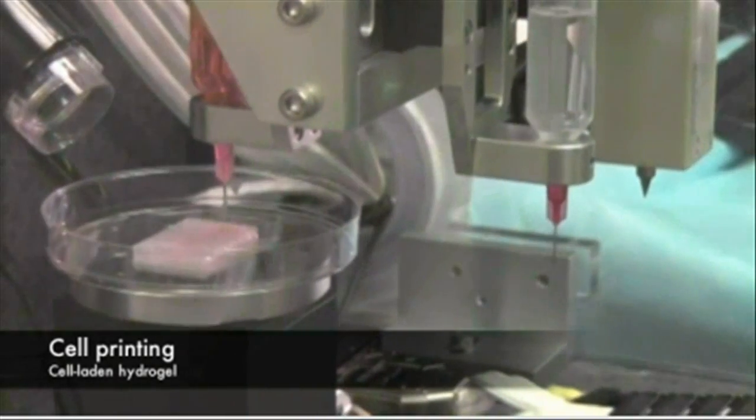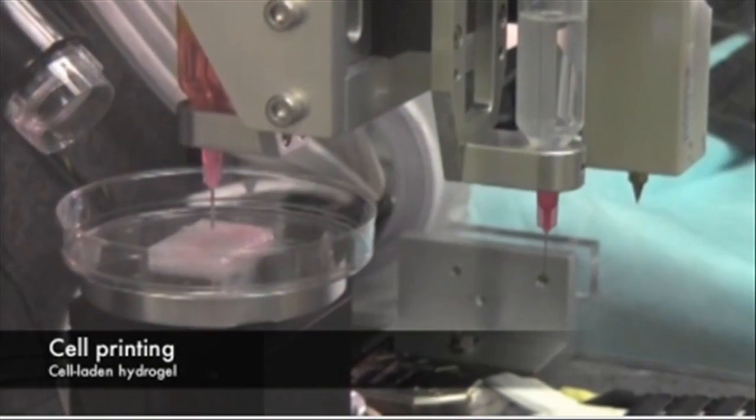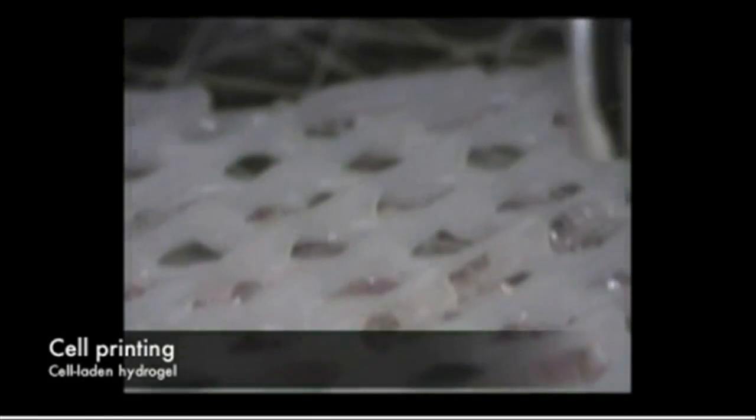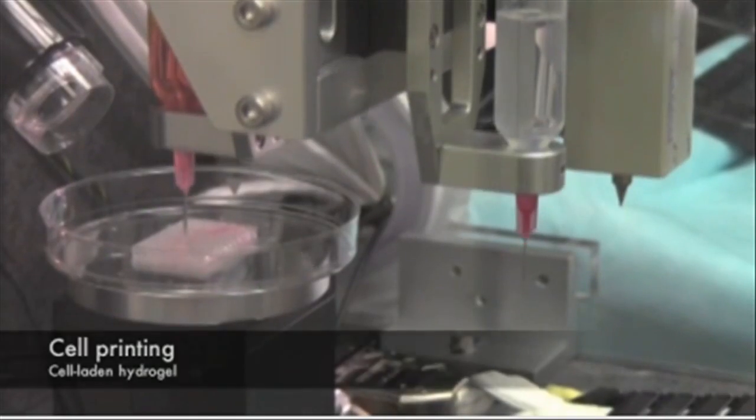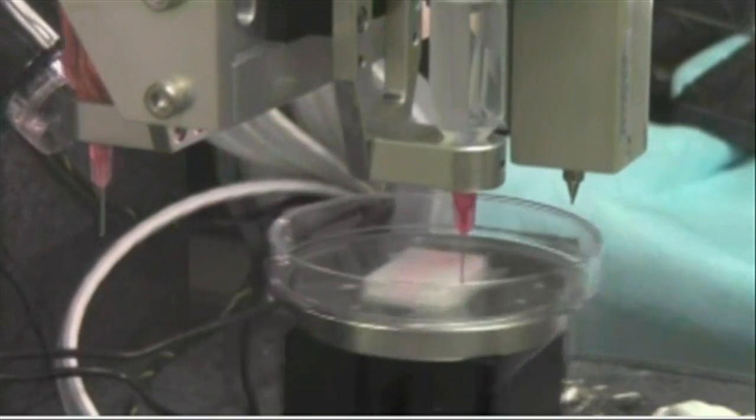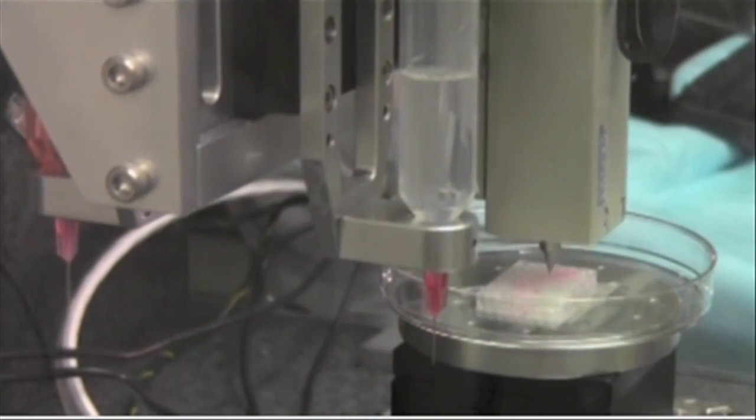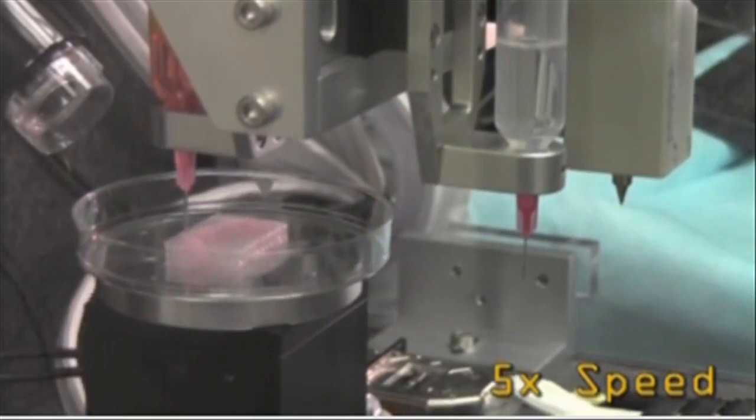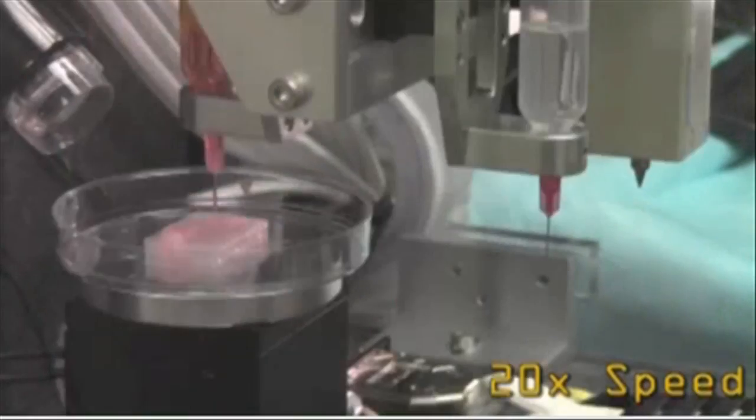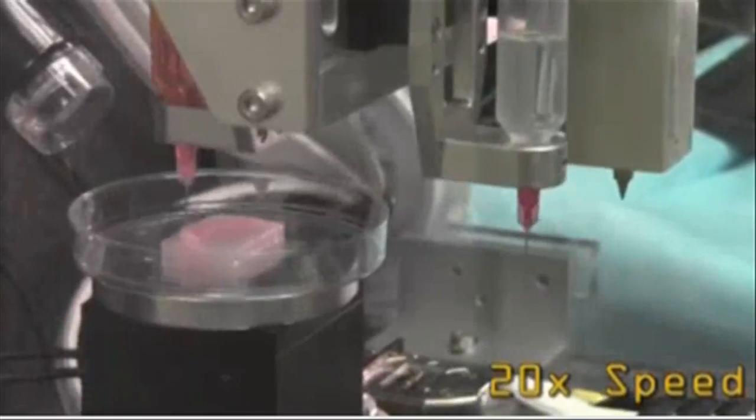The precision of 3D printing makes it a promising method for replicating the body's complex tissues and organs. However, current printers based on jetting, extrusion, and laser-induced forward transfer cannot produce structures with sufficient size or strength to implant in the body. The integrated tissue and organ printing system, ITOP, developed over a 10-year period by scientists at the Institute for Regenerative Medicine, overcomes these challenges.